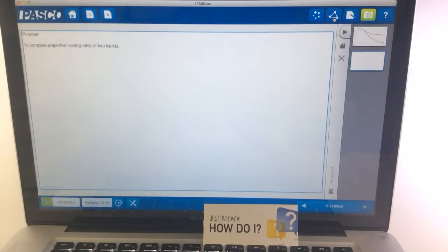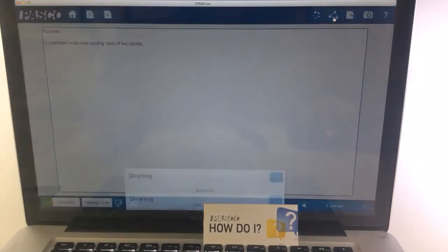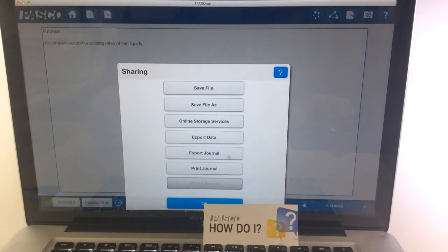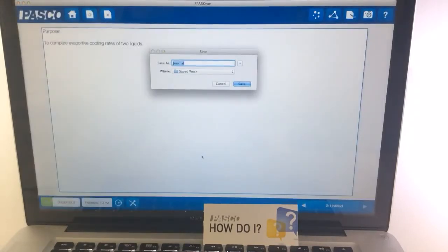And then using the triangle sharing icon, they can share that journal, either by printing it, or they can export it and save it. They could give it a title and select where to save it to. I'm going to save this one to my desktop.